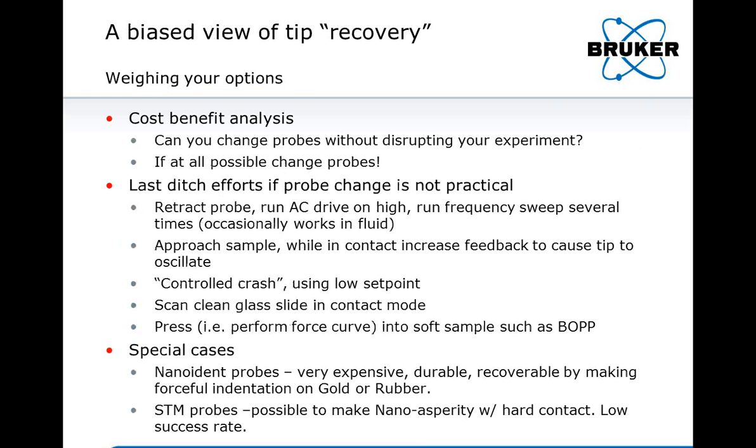So again, for a brief review of recovering your tips, as we think about recycling our tips, we want to put some thought into this. So first, from a cost-benefit analysis, can you change the probe without disrupting your experiment? If at all possible, change your probes.